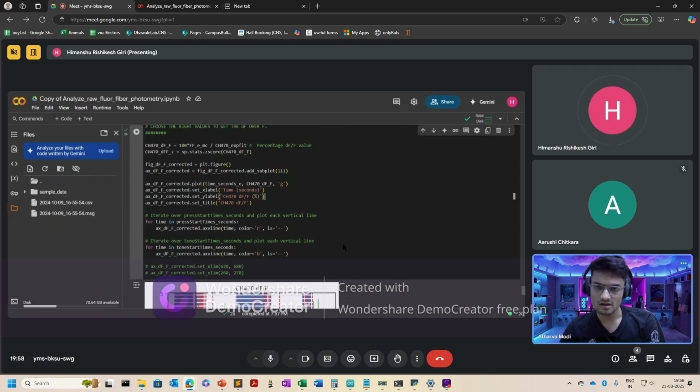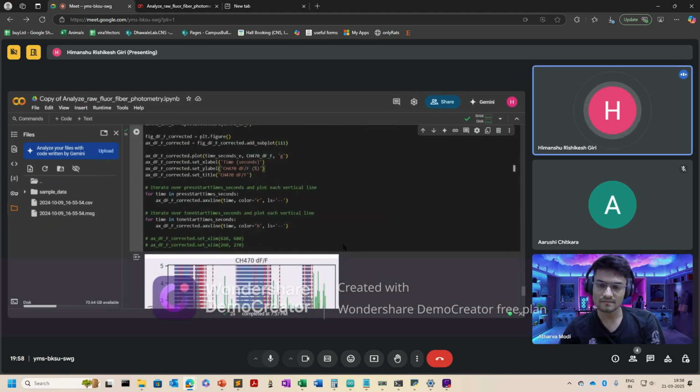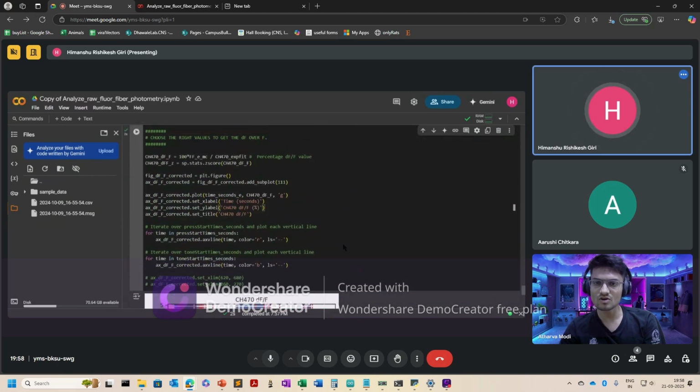Yeah, we have not plotted that. It will look almost the same, but you can plot it. You can actually apply that. So we have to plot the z-score, not 260 or 270. Yeah, this thing.